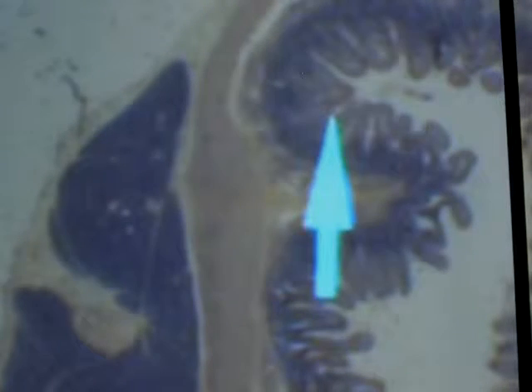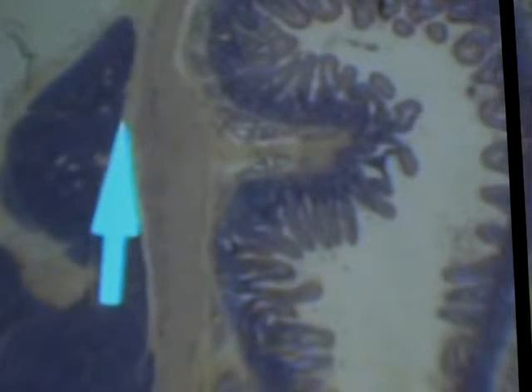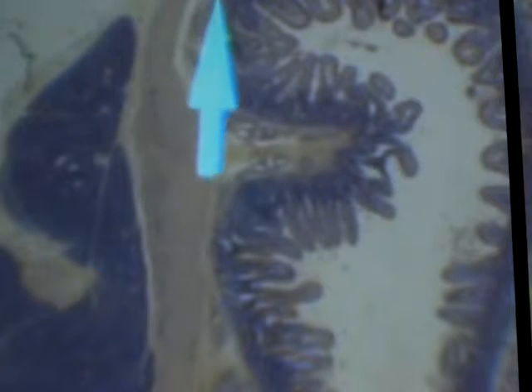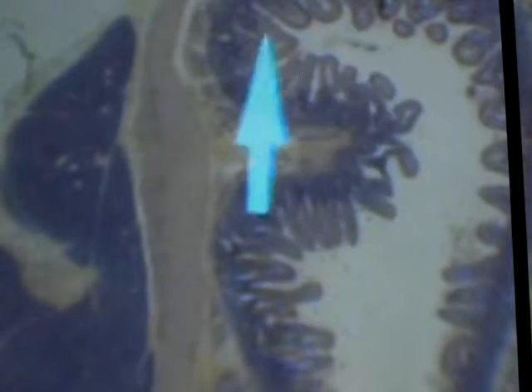Alright. So the intestines have certain characteristics that increase the surface area within the intestine. You have this structure here, which is an outward folding of the mucosa and the submucosa. This is called a plicae circularis. Notice the mucosa here, that's your epithelium, and you're also seeing an upward folding of the submucosa. This entire structure is called the plicae circularis.